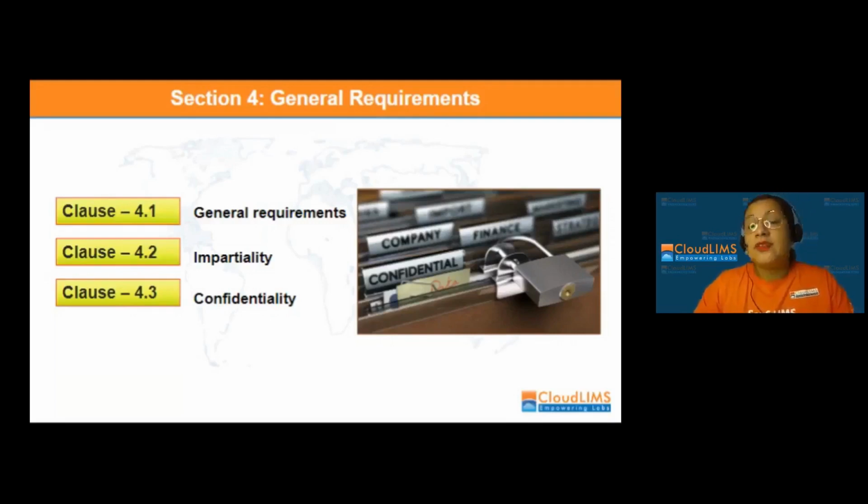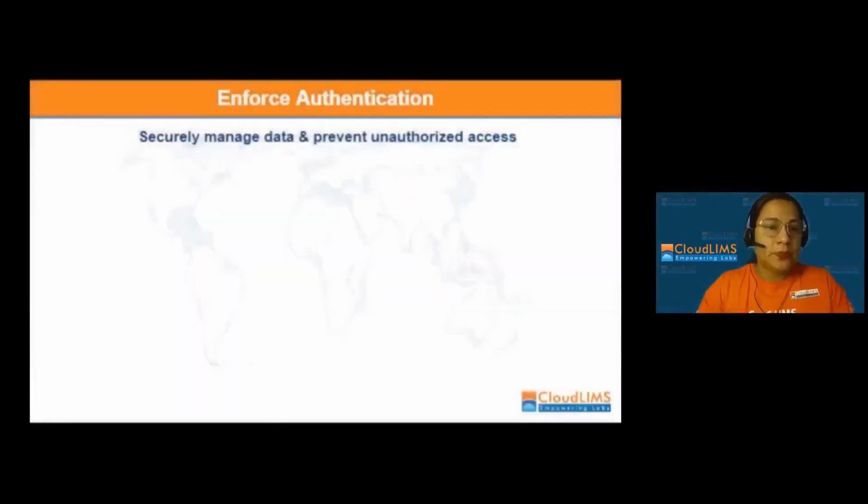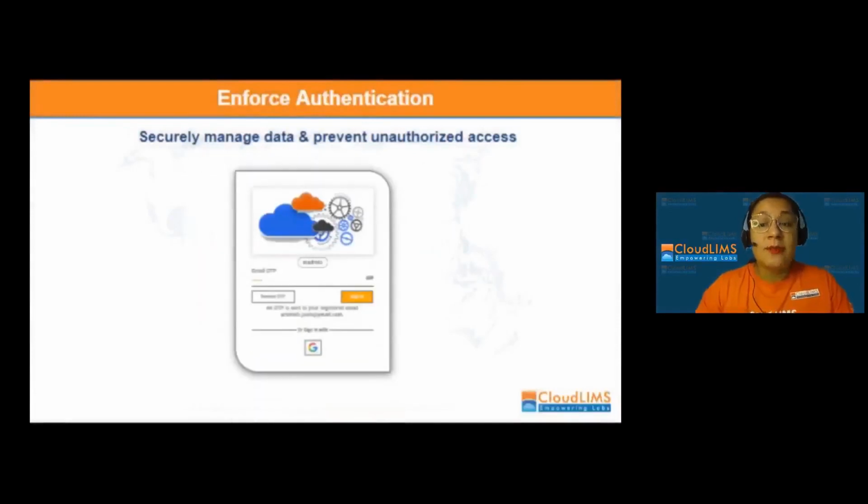This is the confidentiality between the customers and the biobanks, and of course the staff and all those involved in the biobank activities. So the confidential information and proprietary rights of providers, donors, recipients, and users must be protected by the biobank, particularly during storage and transmission of data. So the biobank will inform the donor how their privacy and confidentiality are protected. Biobanks can take advantage of informatic tools such as a biobanking LIMS to securely manage their data.